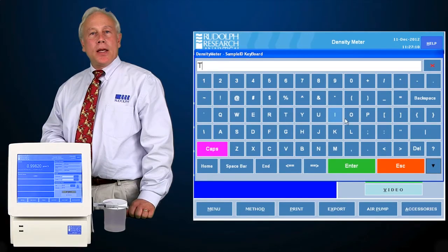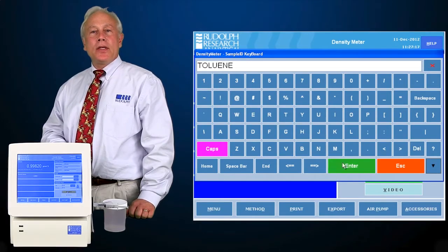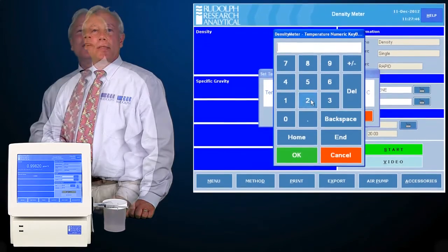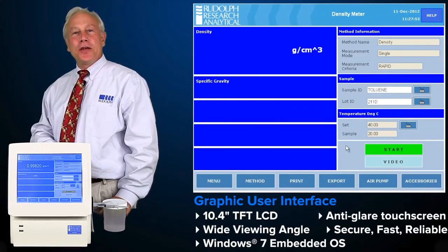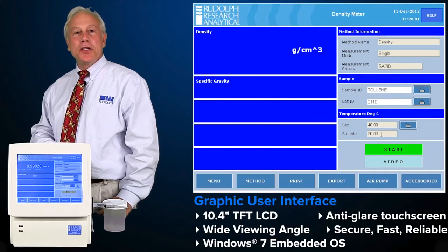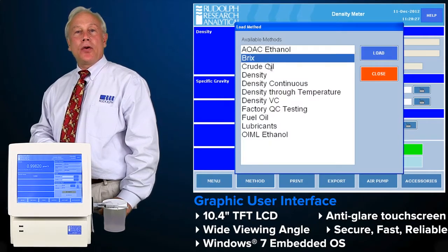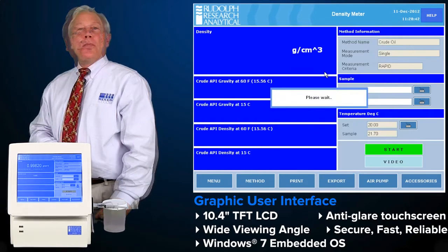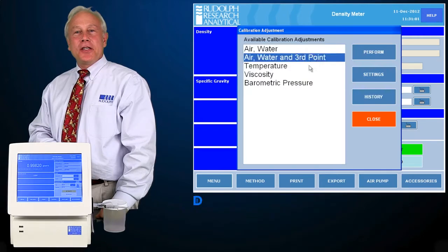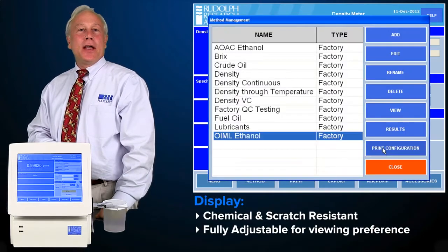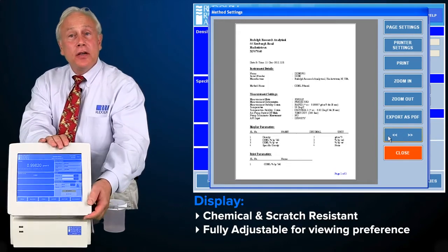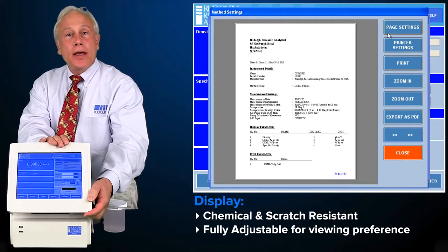our DDM2910 and DDM2911 density meters have the world's most user-friendly interface. Rudolph's graphic user interface is on a 10.4-inch TFT-type LCD with a wide viewing angle and an anti-glare flat panel touch screen. The monitor is the industry's largest and is chemical and scratch resistant. The monitor itself may be adjusted for a comfortable viewing angle.